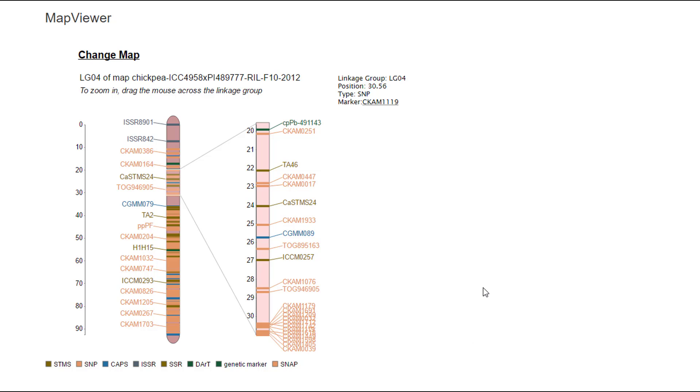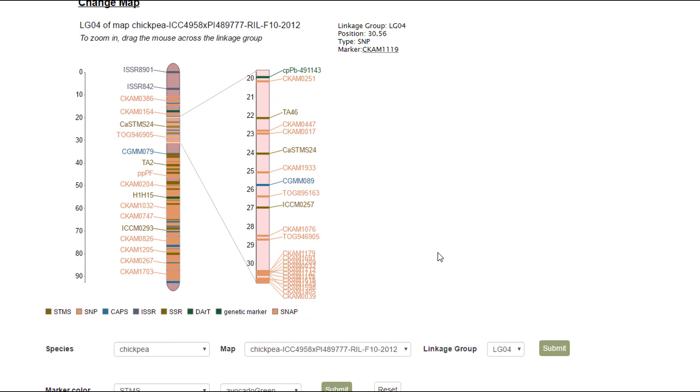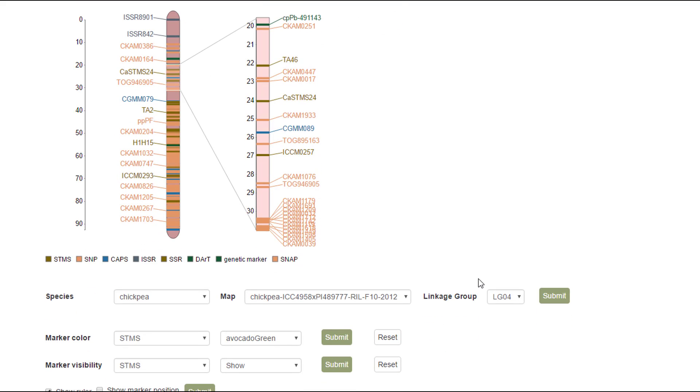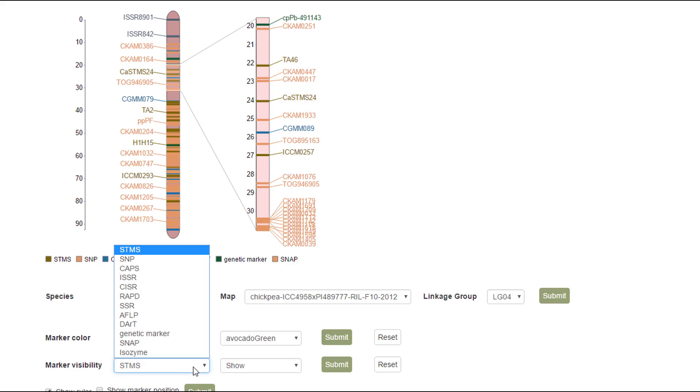Going back to the Map Viewer page, you can see that there is a legend below the linkage group indicating the marker colors. Marker colors can be changed down here in the control panel.